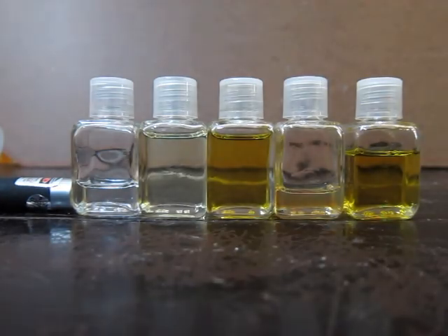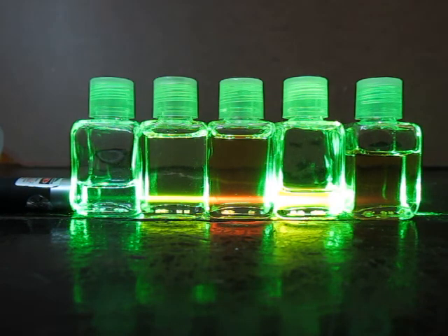Another method is to excite the sample with a laser. Each sample of a range of different oils is fluorescing in a different color.